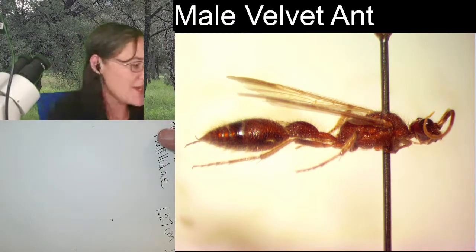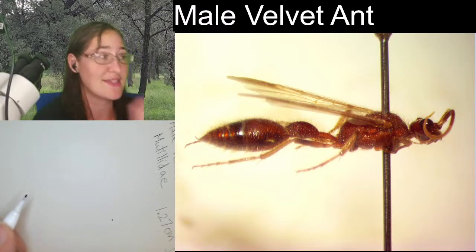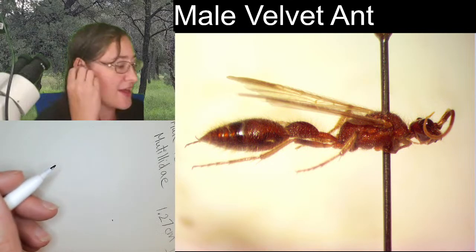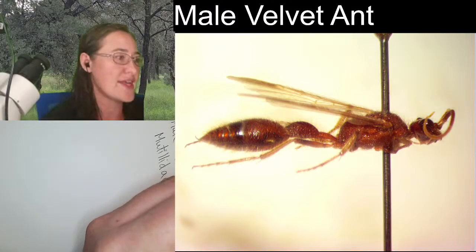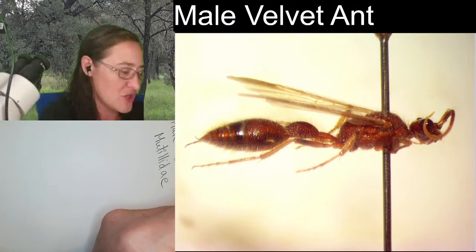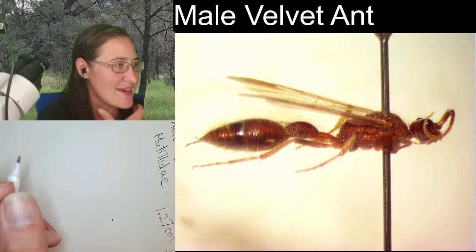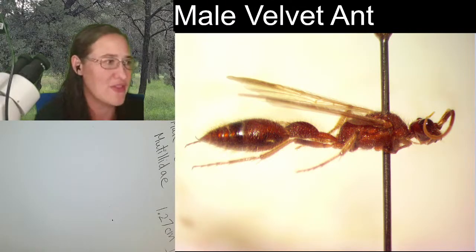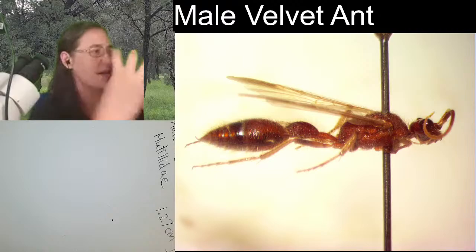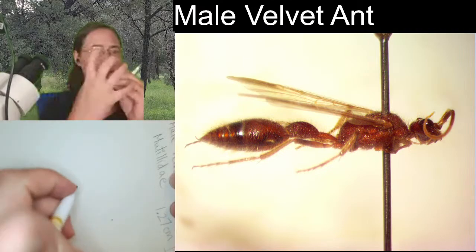Alright, so as you know, I like to go ahead and start my sketch with a really, really light outline, and then I go back over it and kind of darken some of those lines and change them, modify them as we zoom in and determine finer details of our velvet ant. Up here at the front, you can see that peg that the head is resting on. Sometimes we talk about that there's, out of the thorax, this short little peg that the head rests on, and it gives the velvet ant the ability to kind of turn its head in all of the directions.